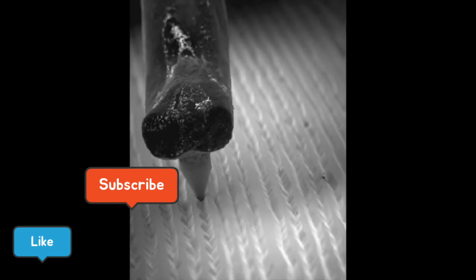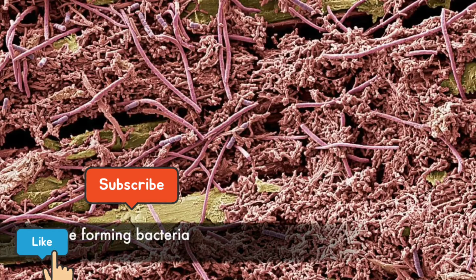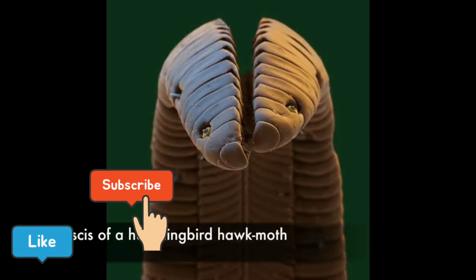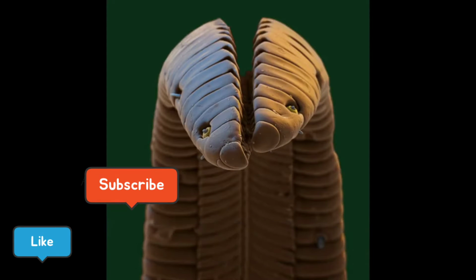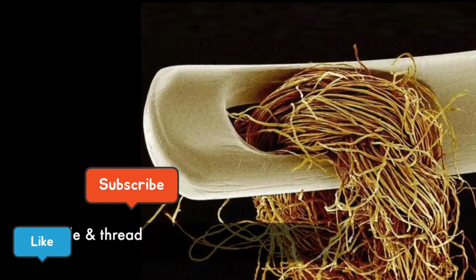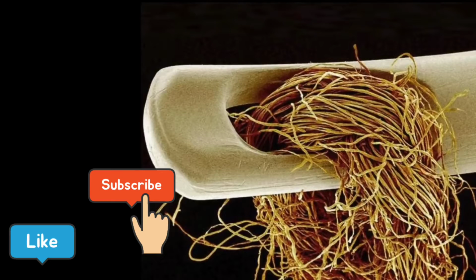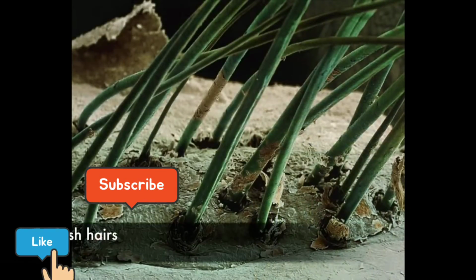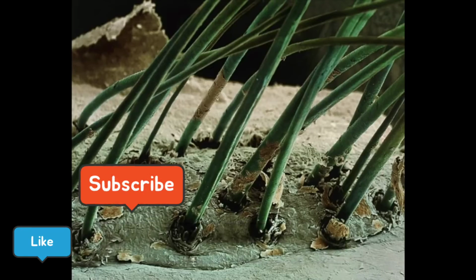This is a close-up of how a record player works. The needle and the little grooves are on the record. This image has been magnified 1000 times to show the plaque-forming bacteria that lurks on teeth. The end of the tongue, or proboscis, of a hummingbird hawk moth. A needle and thread. Eyelash hairs growing from the surface of human skin, magnified 50 times.